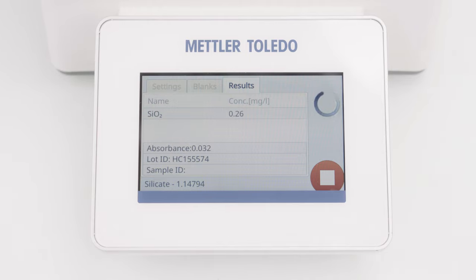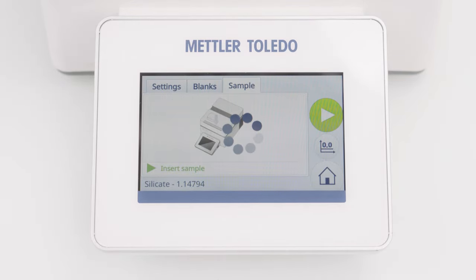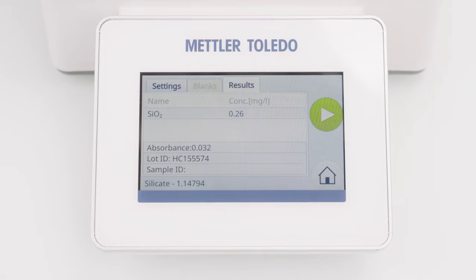And here is the result. To measure additional samples with the same settings, simply click the Start button again. I am now directly asked to insert the sample, because the blank measurement is stored for seven days and no new blank determination is necessary, even if I am leaving the method.